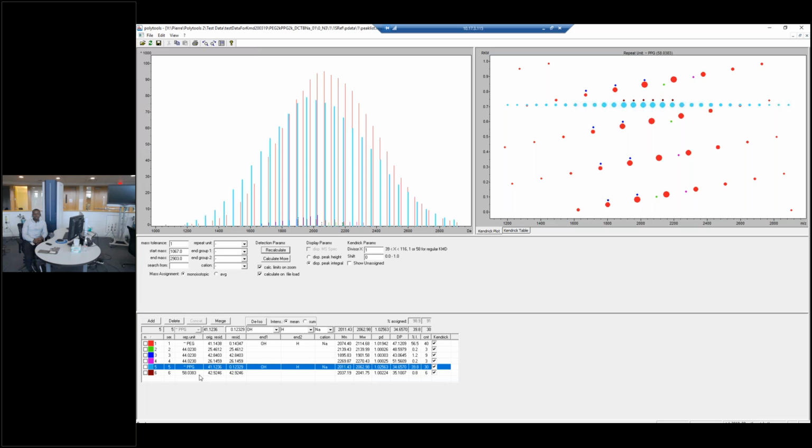It comes with the instrument, it's free, and it's very easy to use. All you have to do is set the different points where you want to image, from what point to what point on a region on a TLC plate, and it will image it automatically and generate an image for you without having to do anything. I'm assuming that was for TLC imaging.